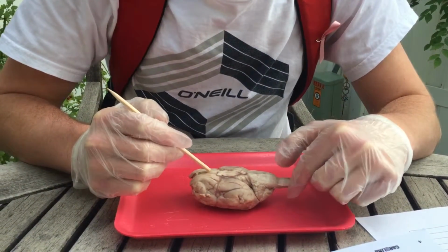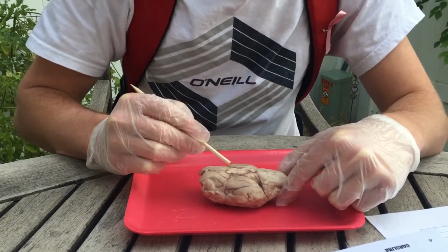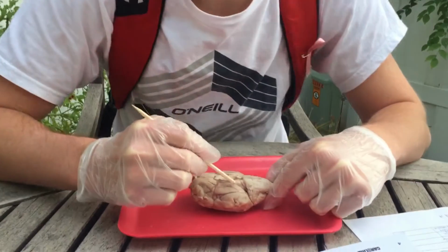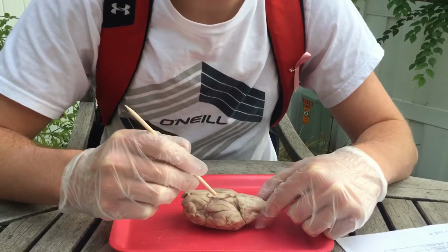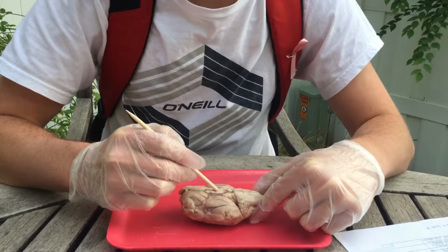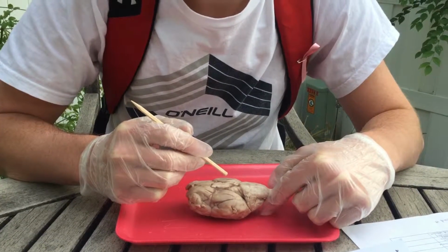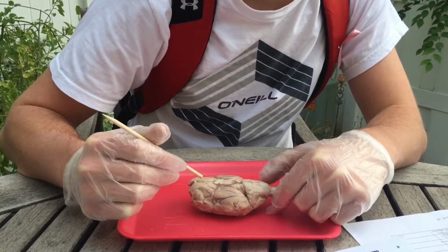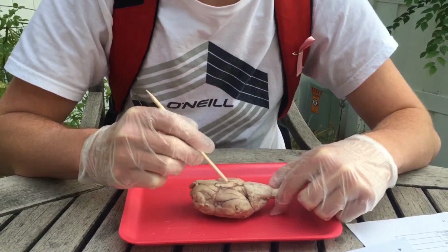And then going on to the optic nerve, which is located right here. And the optic nerve transfers visual information from the retina to vision centers through electrical impulses. This is gross. We have the optic tract, which is just below the optic nerve. Where is it? I don't think we have it on that list. Oh. Well, this is the optic tract.